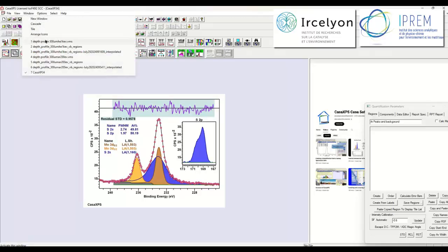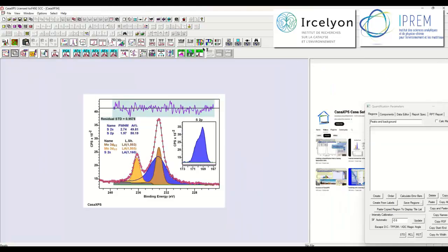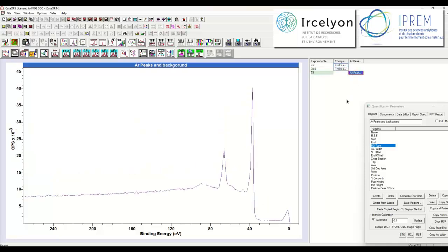We will go to the experiment, the difference file from the helium experiment, so I can collect now all three of these VAMAS blocks that represent the initial surface, the surface after the carbon has been mostly removed, and the surface after most of the carbon and the oxygen has been removed. So there's still some processing to be done on these data.